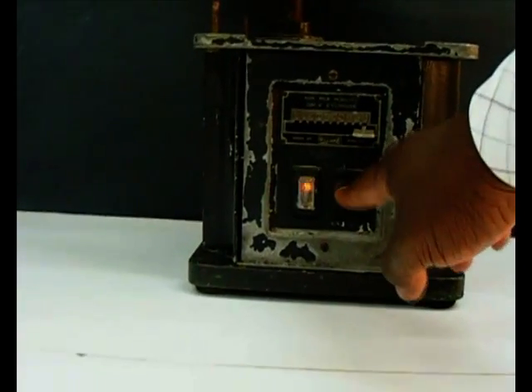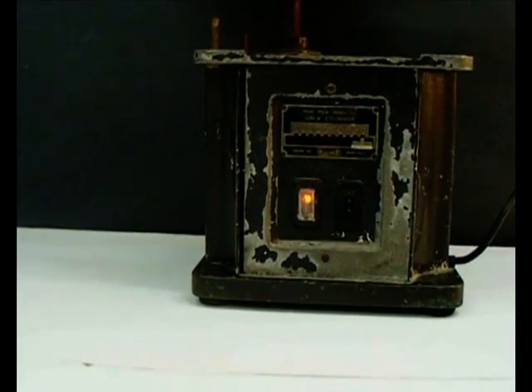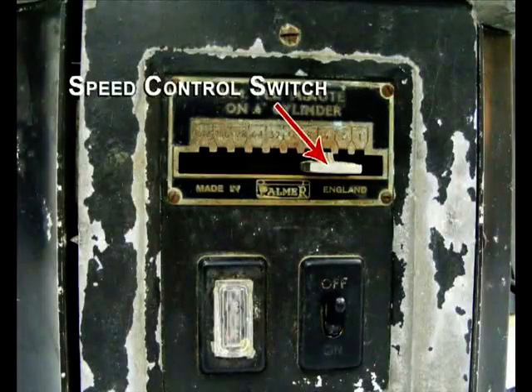The power button turns the chymograph on, and the speed of rotation of the drum is controlled by the speed control switch.